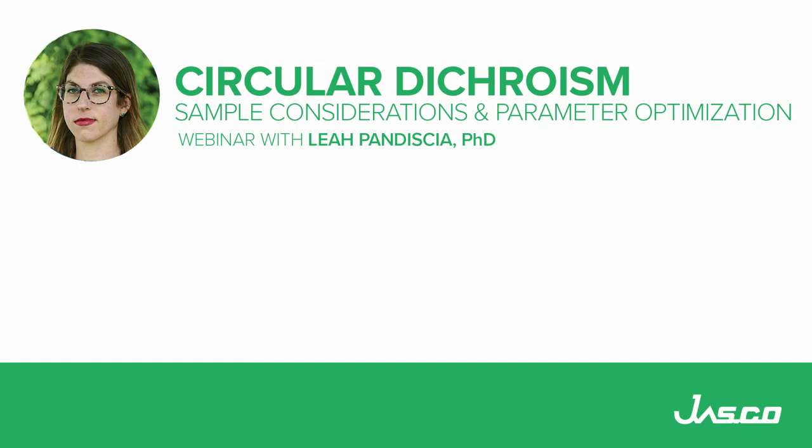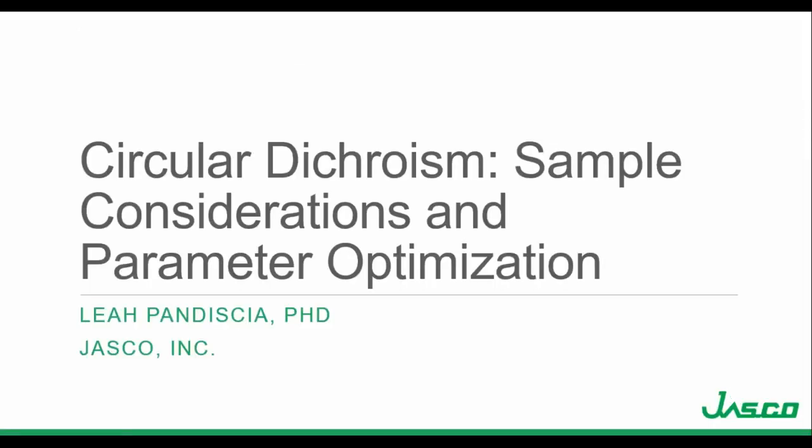Today, we are going to be talking about circular dichroism. This is our second webinar on this topic, but today is going to be more focused on the sample considerations and parameter optimization.